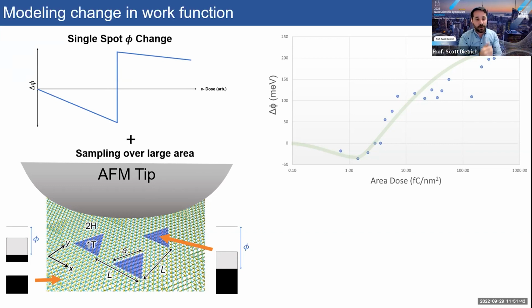I'd love to see how Jim has done those measurements of the moire interference down to 5 nanometers, because that gets us closer to resolving some of these, or we could space them out to try and resolve these islands individually. But for now, we have this averaged area here, but it does seem consistent.